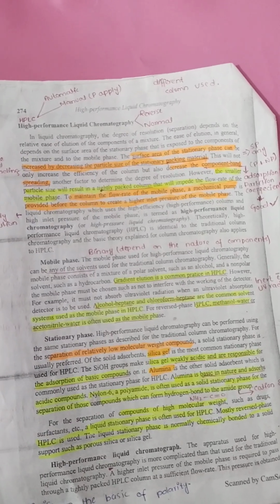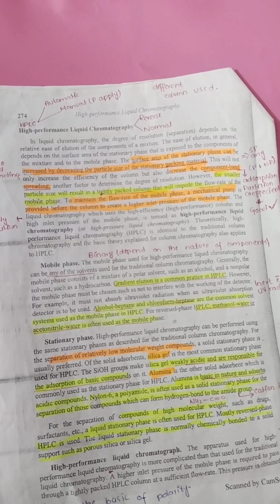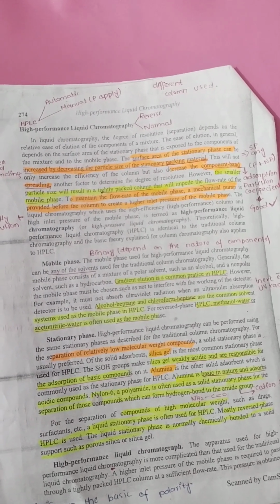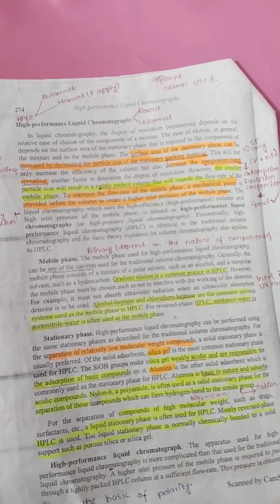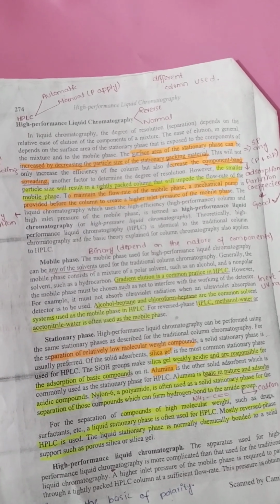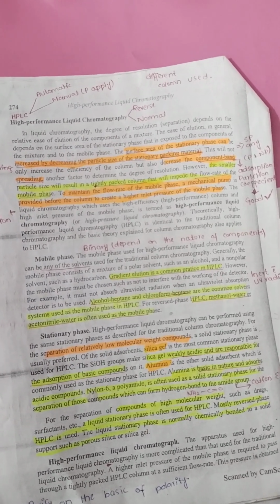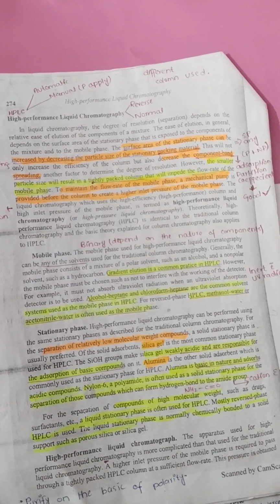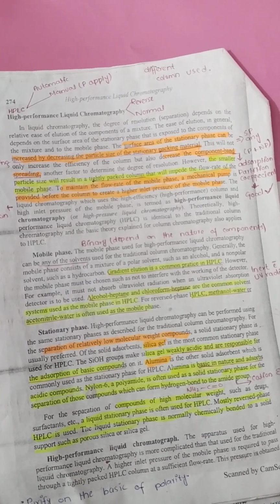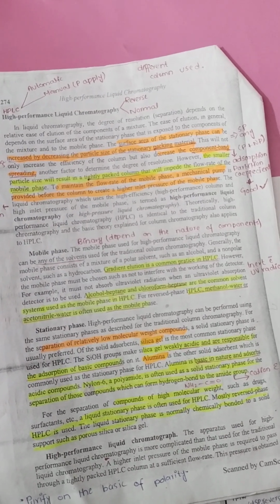But now the particle size decreases, and that results in a tightly packed column, and a tightly packed column impedes the flow rate. That makes it difficult to flow the mobile phase through the stationary phase. For this purpose we use a pump, a mechanical or automatic pump, before the column, because it increases the flow rate of the mobile phase over the stationary phase.